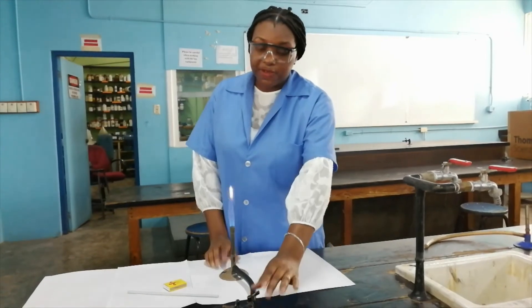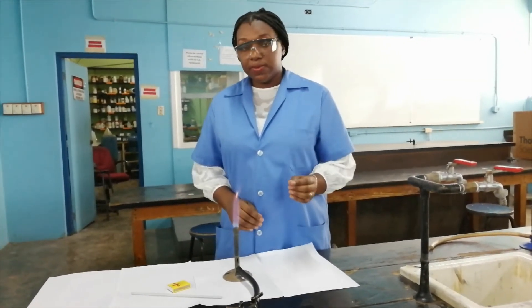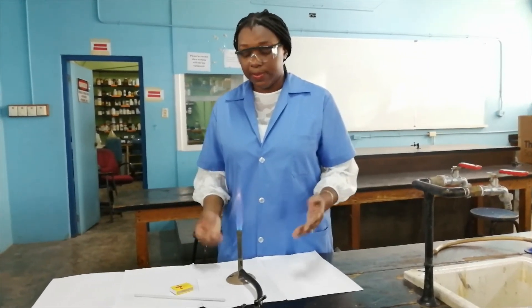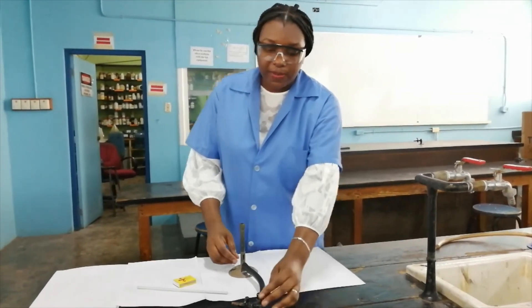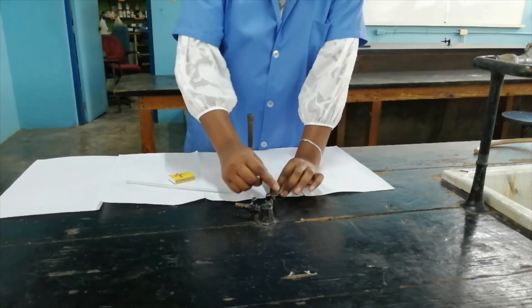We are now going to extinguish the flame because we no longer need it. Once you are not using the Bunsen burner in the lab, you have to turn off the flame — it is always a danger in the lab. So I am simply going to turn it off by putting the lever at a right angle to the outlet.